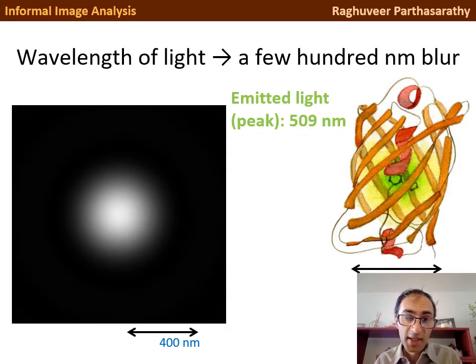In other words, looking at where the photons from this molecule come from, they come from a whole range of positions governed by this distribution that we see here. So this also is not what we would see under a microscope, but it's a little closer to that. Not a 2.5 nanometer wide spot, but rather this couple hundred nanometer wide blur.